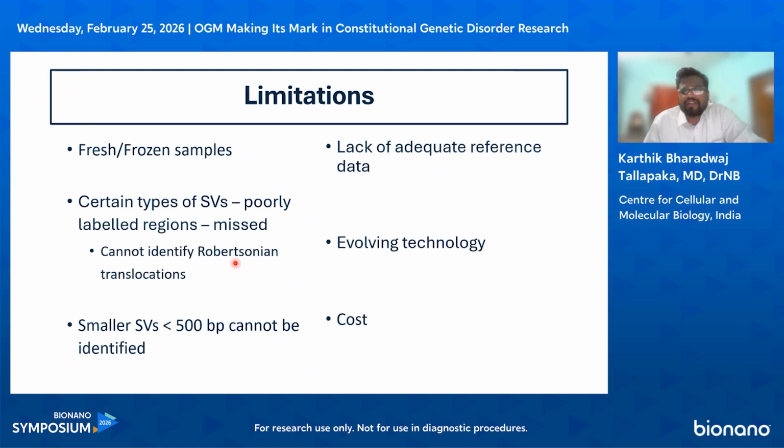And another important limitation is lack of adequate reference data. Over the last 2 years, we've also seen the bioinformatic processing getting improved, and the user interface being improved. So evolving technology means some learning curve, and of course, costs involved could be a limitation for some people.